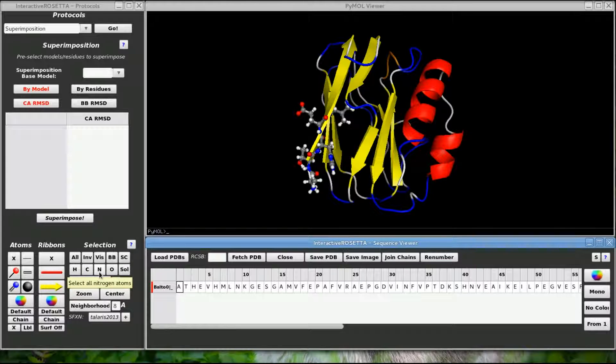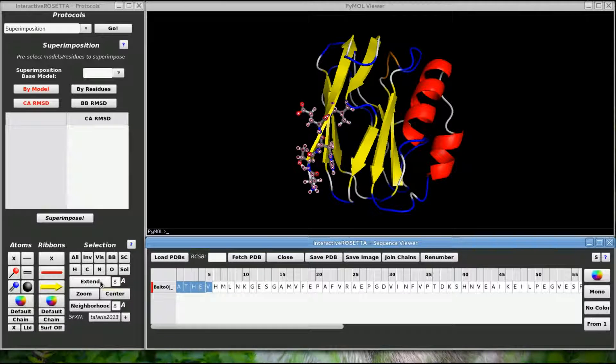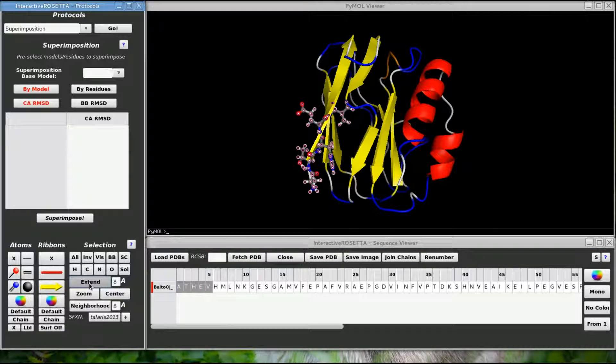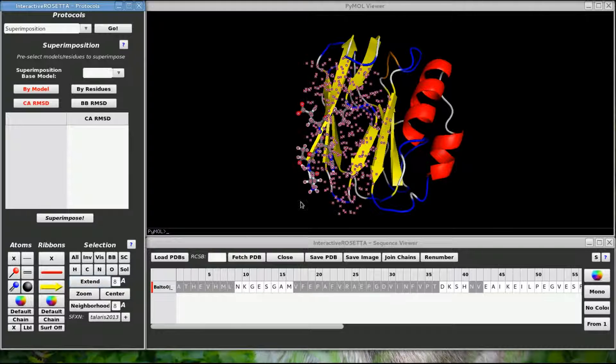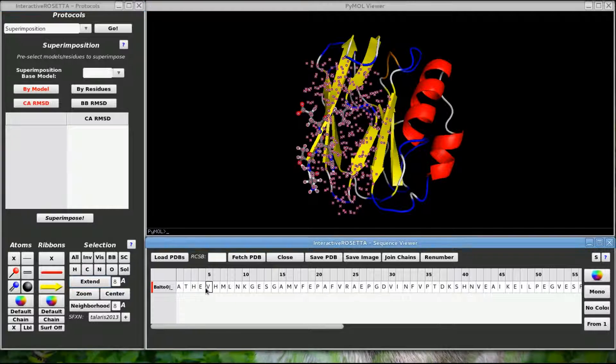These other buttons function the same way for side chain atoms, hydrogen, carbon, nitrogen, oxygen, and solvent atoms. The extend button will expand your selection by the indicated radius. So if I select these residues and hit extend, my selection will expand to include everything within a radius of 8 angstroms. You can change the radius to a different value if you like.